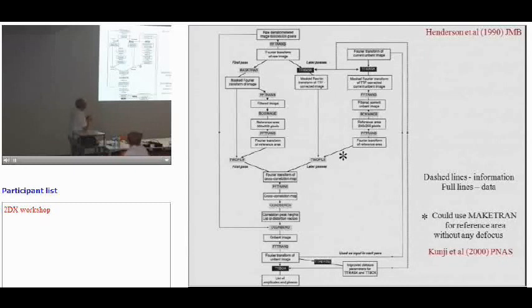You cut out a little bit from the middle of that, which is a representative area of the 2D crystal. Maybe say if it's 6,000 pixels to start with, it might be 300 or 400 pixels square. So a few dozen unit cells, and then that would be Fourier transformed again. So now you have the Fourier transform of the raw image with some filtering to get rid of the noise, and then the Fourier transform of a reference area in the middle of that image.